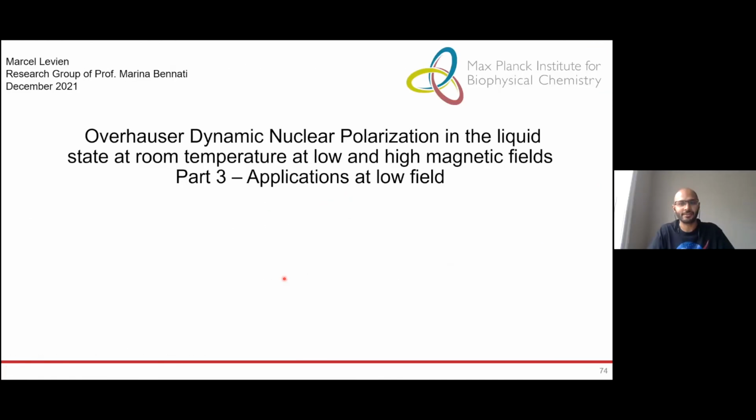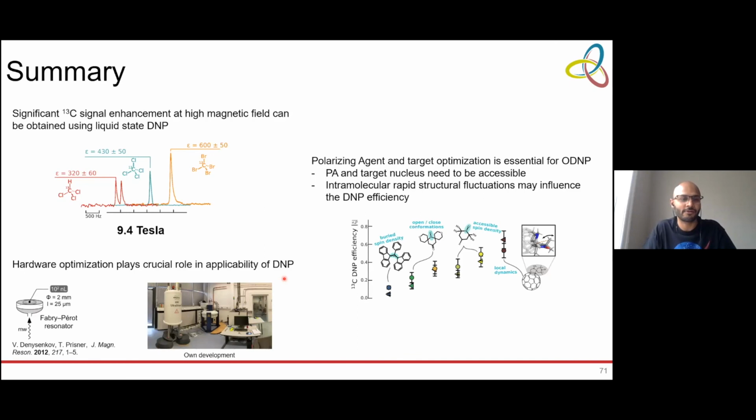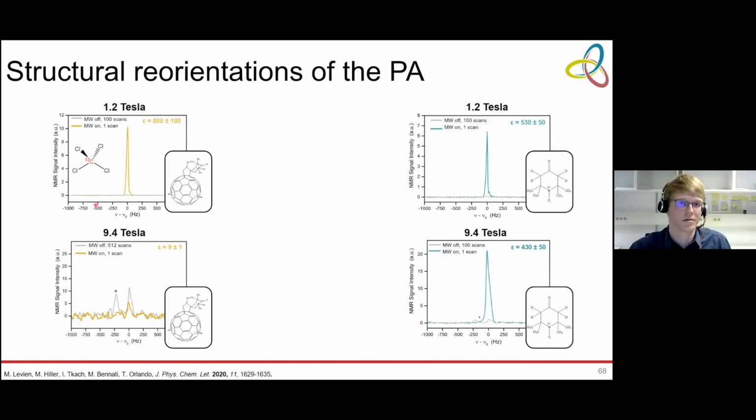I have an add-on. I think it may not be possible on a gyrotron-based setup, but is it possible to do some kind of modulation and have a better saturation factor for this kind of system, if that's the limiting case? At high field, can we have a B0 modulation coil and then have a better saturation? You can have a bit of saturation. Otherwise, there would be no signal enhancement here at 9.4 Tesla. So a tiny bit, of course. More than that, I don't know.